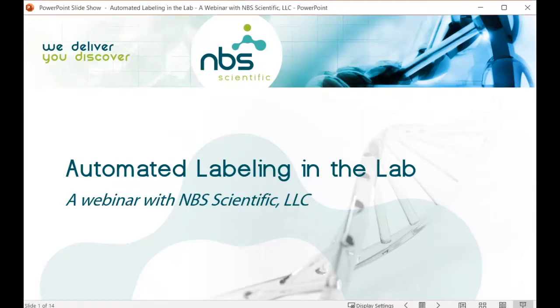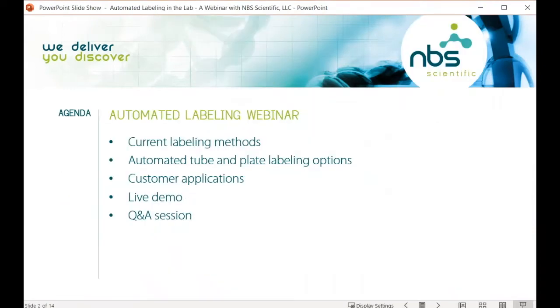So before we get into the live demo or the presentation, I just wanted to run through the agenda really quickly. We'd first like to start by discussing some of the pros and cons of some current labeling methods that people are currently using in the lab. And then we'd quickly like to review some of the tube and plate labelers that we have in our portfolio, and then finally walk through a couple customer applications to really showcase how people are currently using this equipment in their lab. And then we'll move into the live demo of the Sci-Print VX2. My colleague Ryan will show us how easy it is to use the software to set up a label, and then also show us the unit in action. And then, as I mentioned before, we will conclude with a Q&A session.